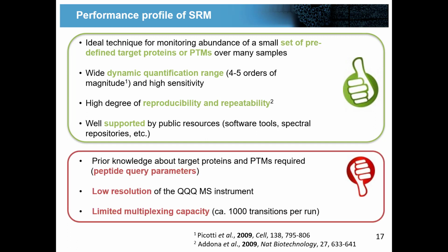Disadvantages: you need to have prior knowledge about all your target proteins and PTMs. It's what I refer to as peptide query parameters. So you need to have a ready assay. The resolution of the triple quad mass spectrometer is rather low.